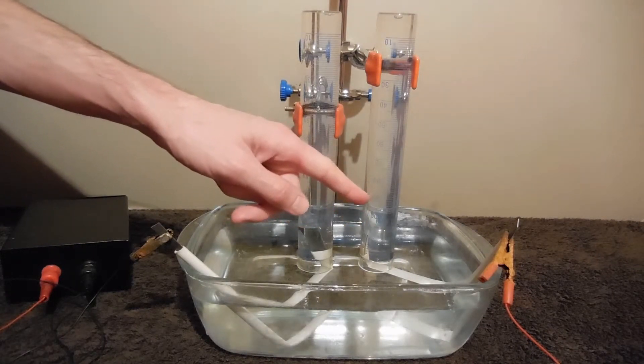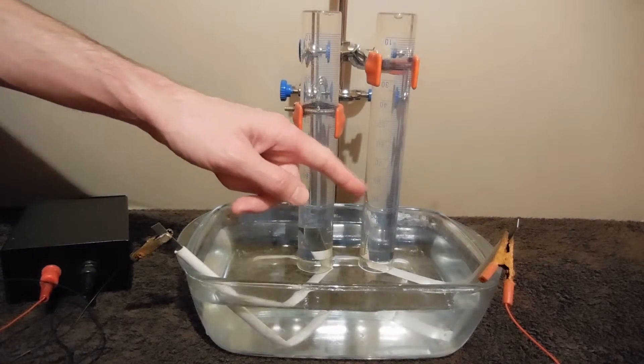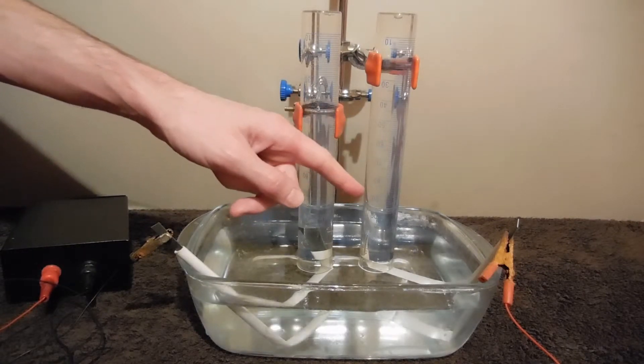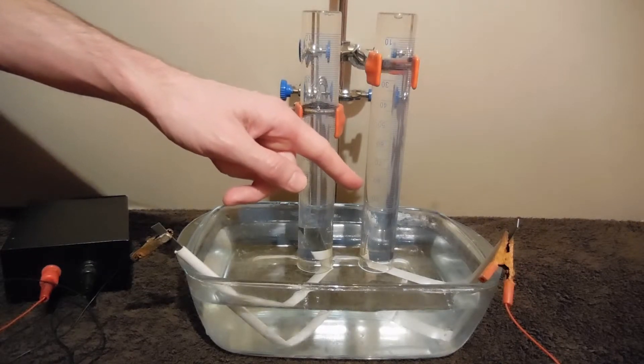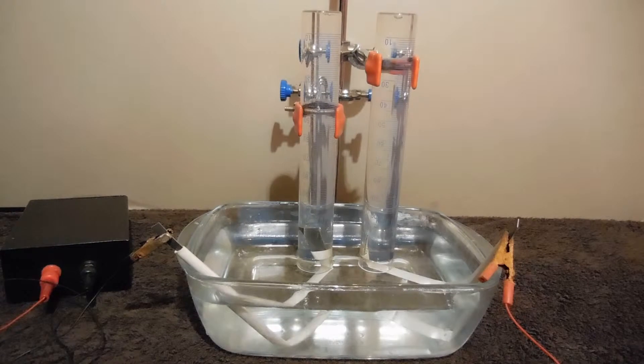In this graduated cylinder there should be no oxygen, as it is consumed during the reaction, which is similar to electrolysis of water with copper electrodes.